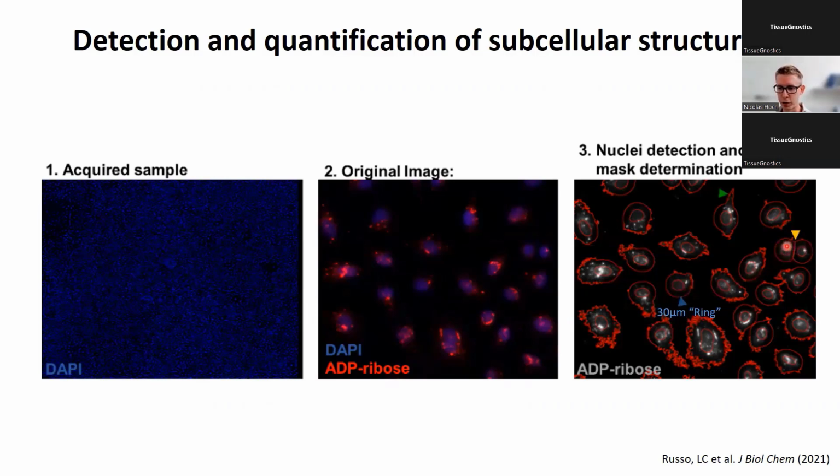If two cells were too close to each other, then this ring would stop growing, and you essentially get a boundary between the two nuclei, somewhere roughly in between. I mean, we don't have a true marker for the cell cytoplasm here. We're still working on it. It's actually harder than it sounds to get a nice stain for the cytoplasm.